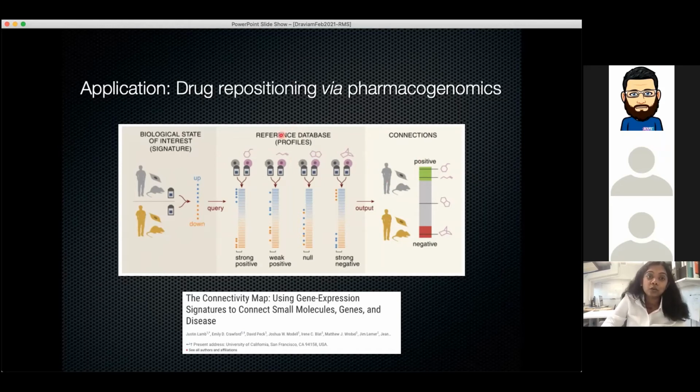So we could look at this connectivity map and identify new microtubule stabilizers or destabilizers that look just like standard microtubule altering drugs that we use in the lab. So for example, are there new drugs that look like Taxol? Or there are drugs that look like Nocodazole? So you could easily query this data set to ask which of these drugs might be closer to, not structurally, but closer in terms of how it affects the transcriptome.